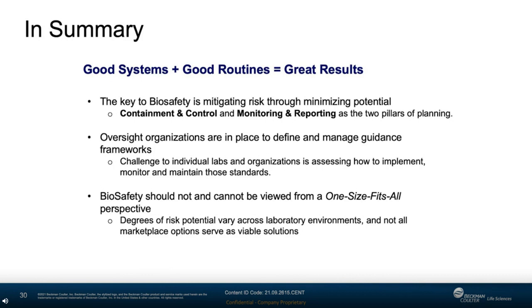Carpenters say measure twice and cut once, and I'm going to say balance twice. Well, I don't really say that, but be sure and be confident before you load a rotor. If you aren't sure which tubes are the balanced pairs, weigh them again. If you aren't sure how to use a centrifuge or any piece of equipment, ask. And if you forget, ask again.